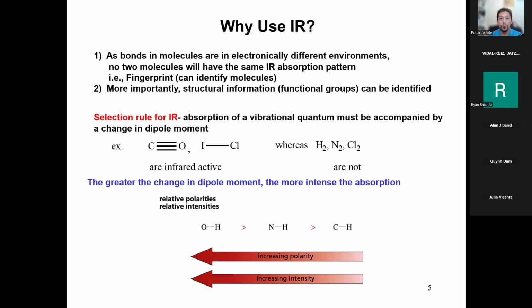And that is why functional groups are the things that stand out the most, because functional groups are made out of multiple atoms of different polarities, right? Carboxylic acid, CO, oxygens. Alcohols, oxygen, hydrogens. Esters, carbon, oxygen, oxygen. Ethers, carbon, oxygen, carbon. Amines, nitrogen, hydrogen. Those are all different atoms. They are heteronuclear and they are polar, so you see them in IR. We'll see more examples pretty soon.